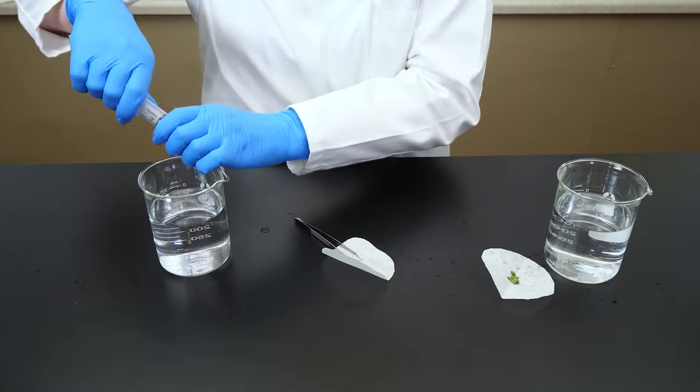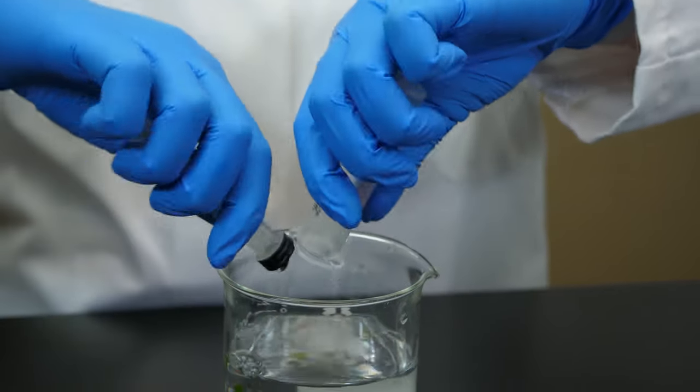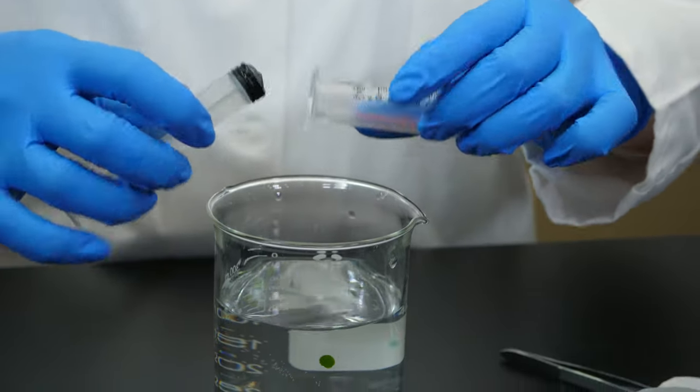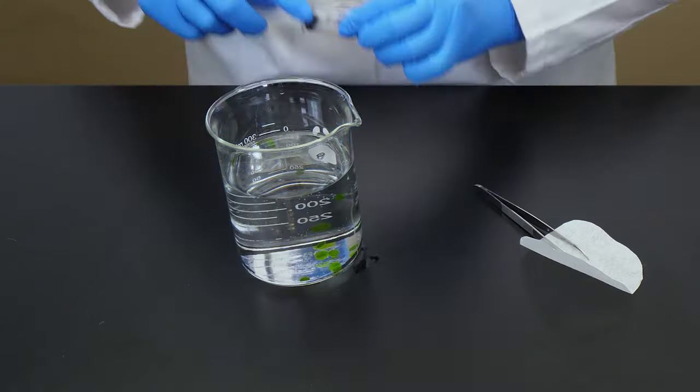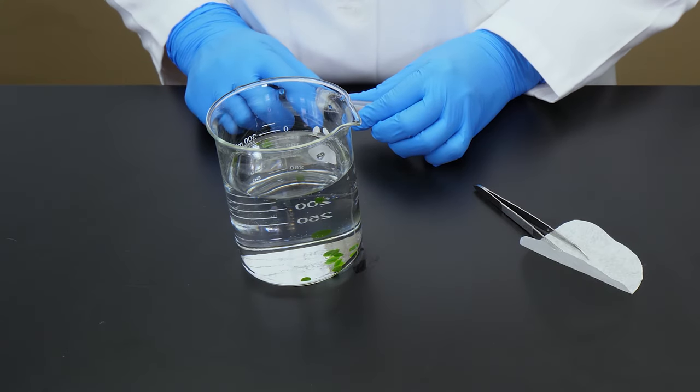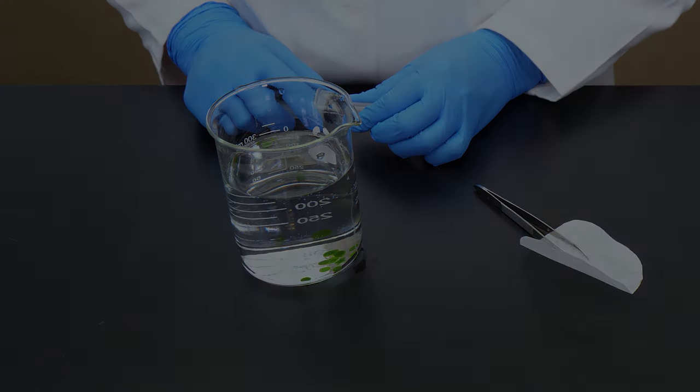Now, we are ready to dump the chads into one of the beakers containing the sodium bicarbonate solution. This group of chads will become our control group. Our control group will be placed in a dark enclosure.